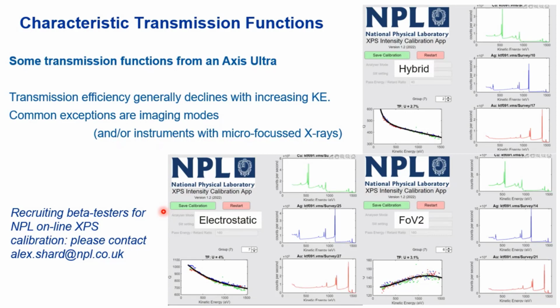All we want you to do is be able to spot a copper, silver, and gold, and take some spectra without saturating your detector. And we'll see whether this is going to be a useful thing for the community or not.